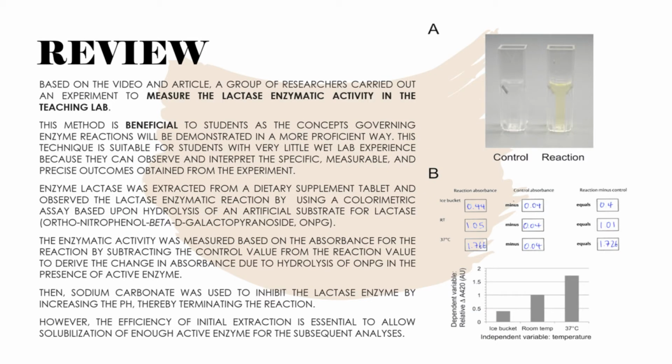Based on the video and article, a group of researchers carried out an experiment to measure the lactase enzymatic activity in the teaching lab. This method is beneficial to students as the concepts governing enzyme reactions will be demonstrated in a more proficient way. This technique is suitable for students with very little wet lab experience because they can observe and interpret the specific, measurable, and precise outcomes obtained from the experiment.